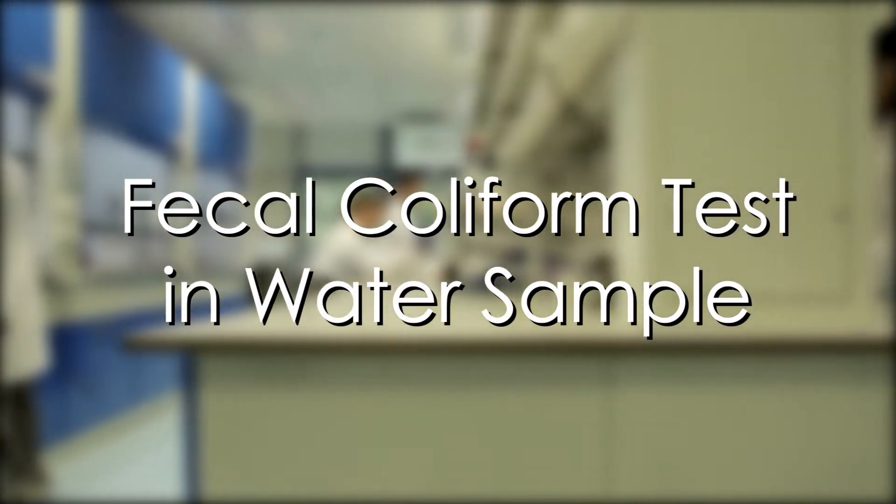Welcome. In this video, we will be showing you how to test for fecal coliform in your water sample.